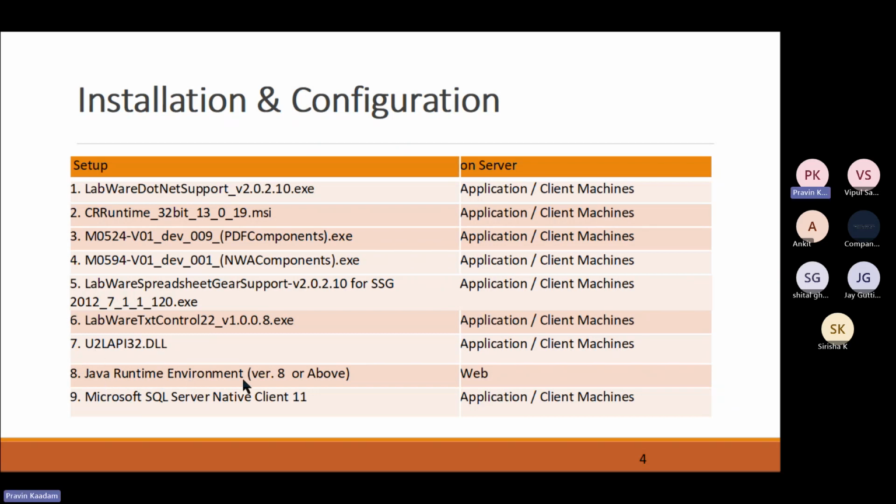The Java runtime environment also has to be installed. And then finally, the SQL client. This is the SQL Server client, which is required to connect to the SQL Server database.